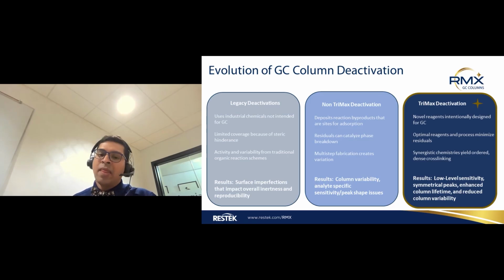And also, there are spots for adsorption of analyte. Here as well, the results are bad peak shape, column variability from one column to another, sensitivity issues, and peak shape issues. Again, at this stage, we were talking about more of a higher ppb level detection.